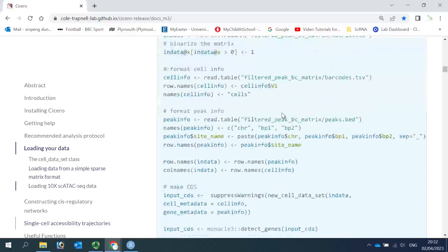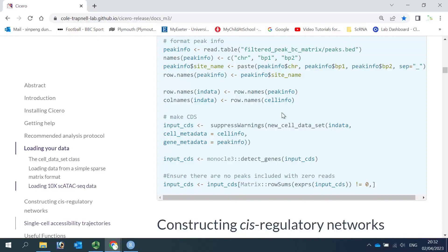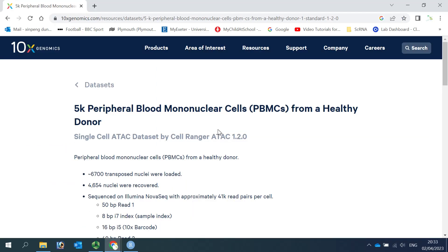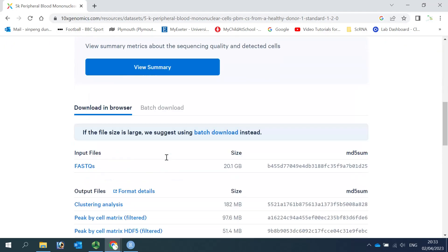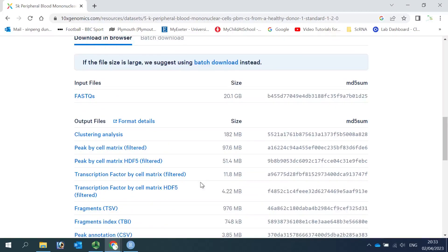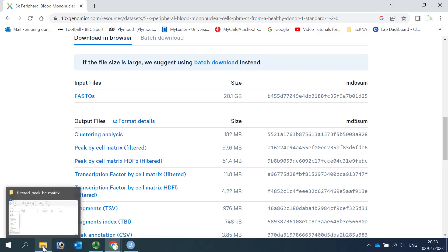Here is the code to load the dataset. I'm going to use the 5K PBMC dataset as an example for the demonstration. You can download the 5K ATAC data from the 10x Genomics website. If you scroll down, you can see the files you need to download are in the peak-by-cell matrix. If you download it, there are three files inside — I downloaded it already.